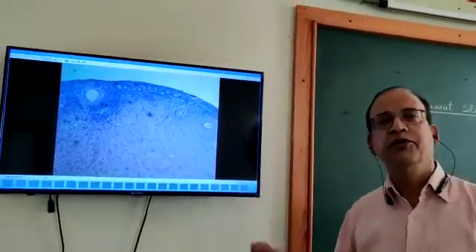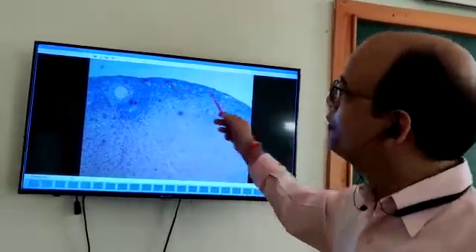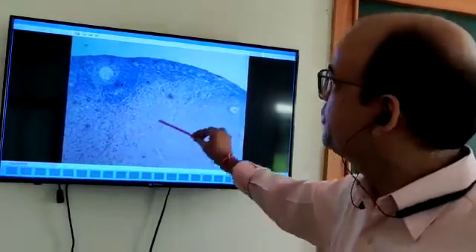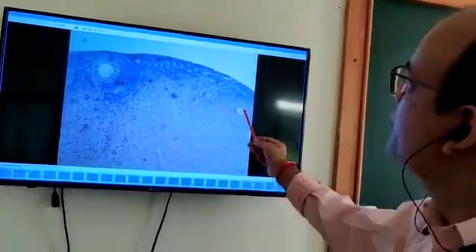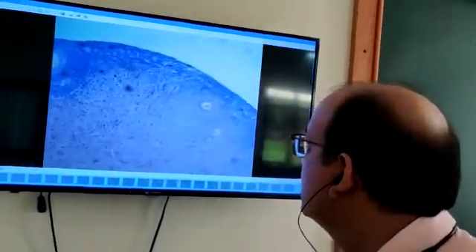Now I am showing you the transverse section of ovary. In this slide you can see all this connective tissue, and in this connective tissue you can see these Graafian follicles. These are immature follicles. This is a somewhat mature Graafian follicle. Here in the connective tissue you can also see blood vessels supplying the ovary. These are some other Graafian follicles.